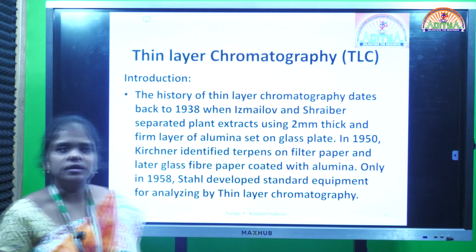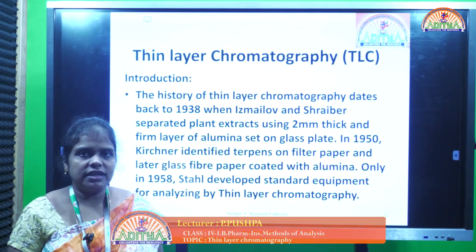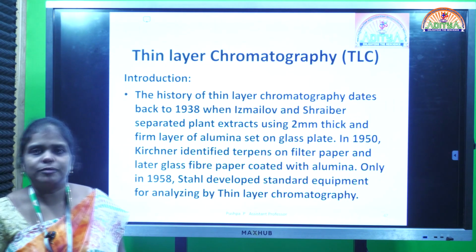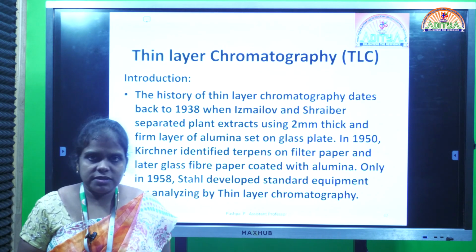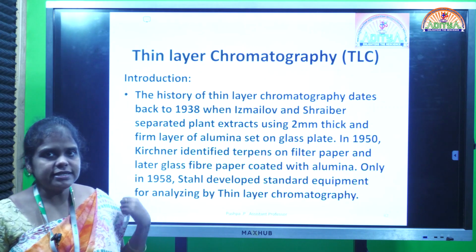Good morning everyone. Today we are going to discuss another type of chromatographic technique, that is thin layer chromatography. Till now we have discussed column chromatography in two types, adsorption chromatography and partition chromatography, and next our topic is thin layer chromatography.